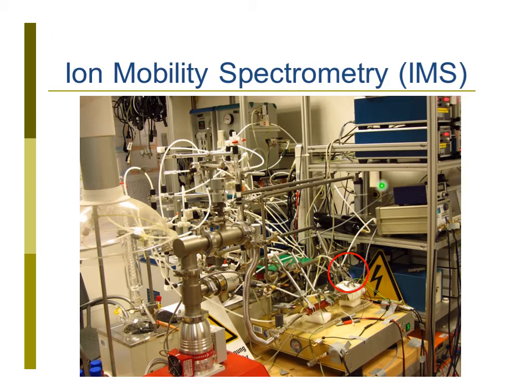As you see here, the setup, there's a lot of electronics involved here, a lot of power supplies. The device needs here in front, low voltages for the detector. It needs for the operation, high voltages, several thousand volts.